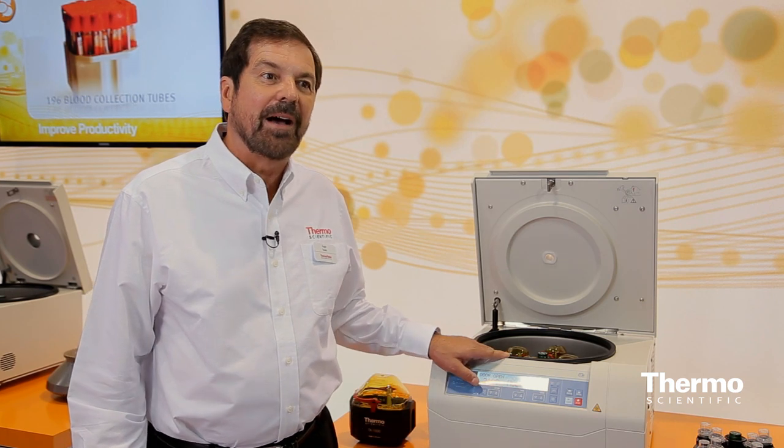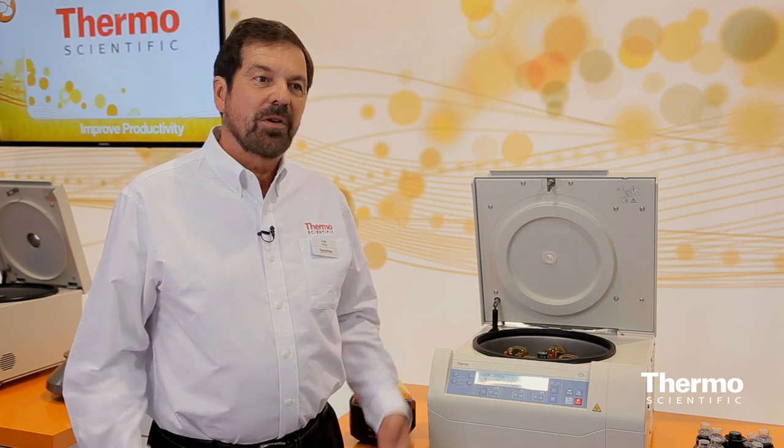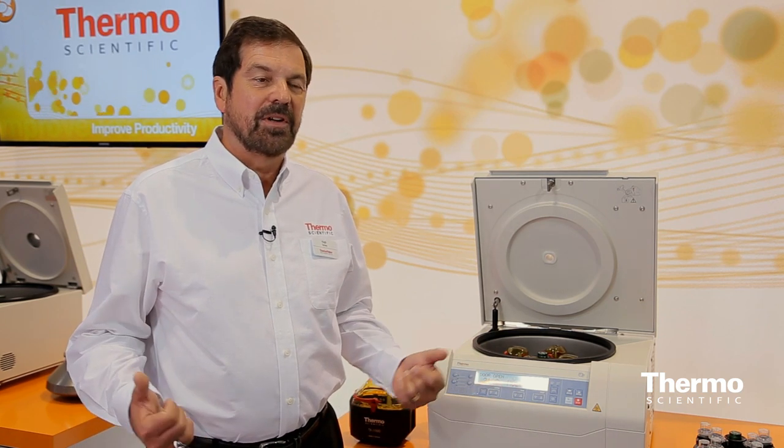The stands-out part is even more exciting, and that's really outstanding performance. Customers in the clinical lab really want something that's easy to use but yet has good performance. And here in our booth we're featuring productivity — it enables them to do more tests and get more samples run in an easier manner.